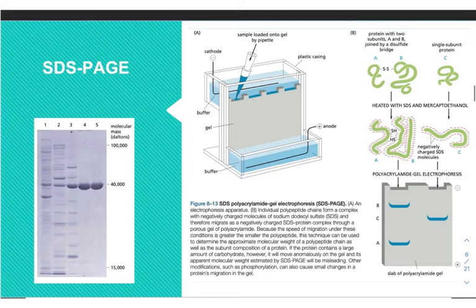Another thing to consider with PAGE is that the majority of tertiary structure and secondary structure interactions are non-covalent, right? When we denature things, we break non-covalent bonds. We do not break covalent bonds. The exception to this entire tertiary structure as non-covalent thing is disulfide bridges. So disulfide bridges are where we have two amino acids called cysteine, and they each have a sulfhydryl or thiol group. And this starts out looking like this.